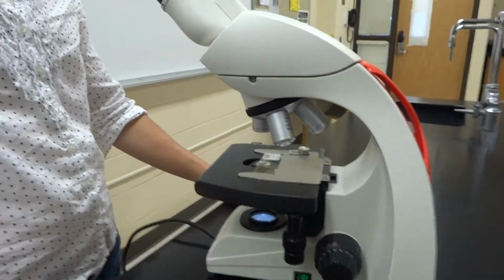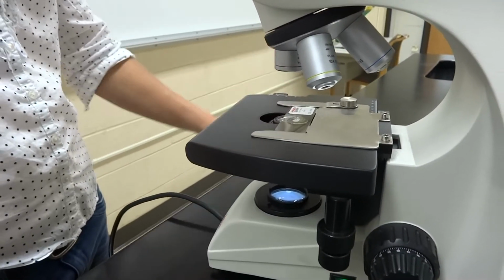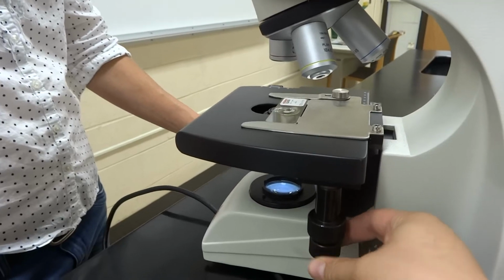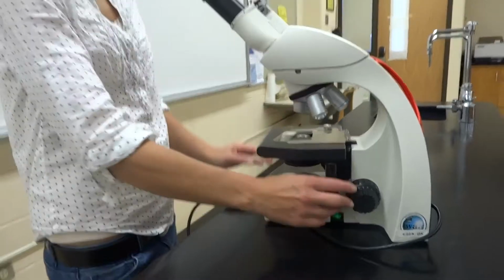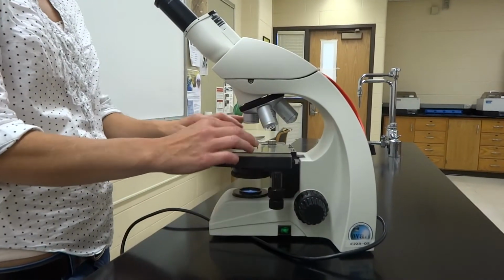I like the sound. So if you do this, then your slide will stay very happily right on the stage so that when you move those mechanical controls, the slide will be moving with them. If you set it on top or try to cram it underneath, this will not work out as well for anyone. So make sure that you are loading that in properly.